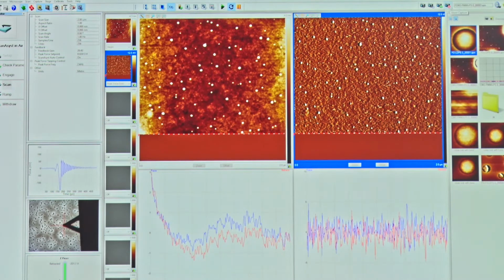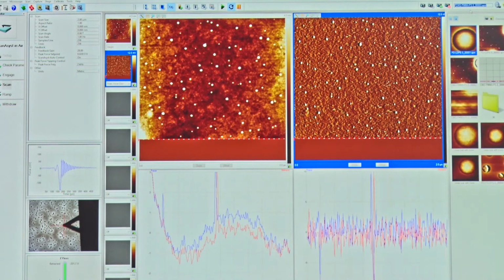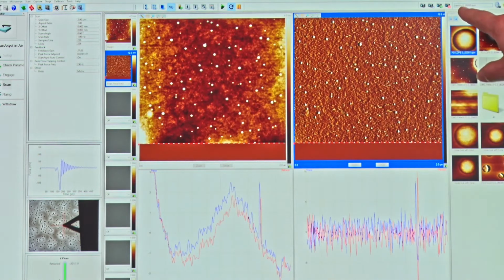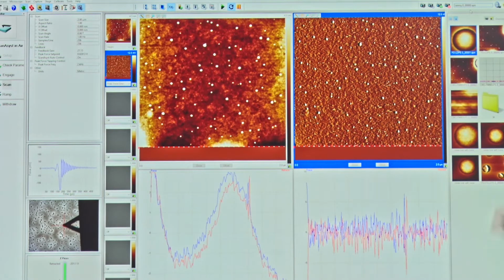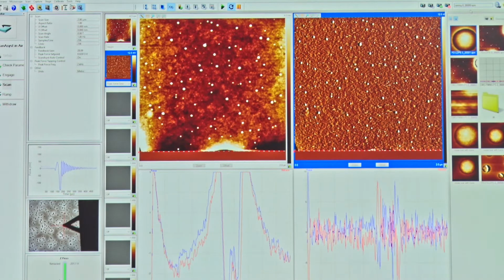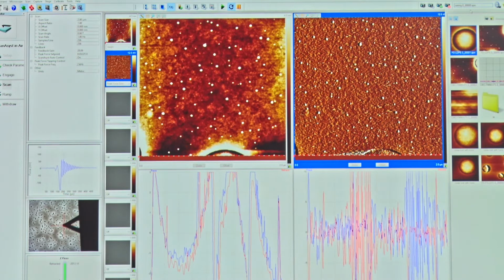Okay. Now just to the right of those 4 icons, we have a text entry where we can choose what name we want to give this particular scan. So I'm going to call this just training here. And you see that we now have training. When I press enter, it will automatically put in some incremental number, because maybe I'm going to do a continuous capture and maybe that will be 100 frames. I don't want it overriding itself. So it will automatically increment that, and the file type is called .spm. So this is what we call an SPM, or an image file.